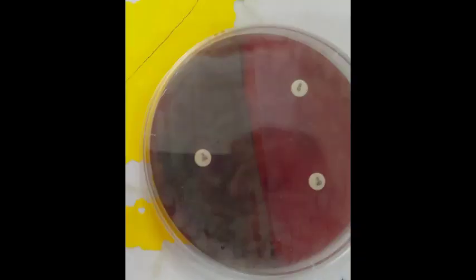After incubation, it was noted that the novobiocin disc developed an inhibition zone of 20 millimeters. Therefore, we can conclude that the Staphylococcus organism that we are identifying is Staphylococcus aureus. This is because it was positive for the coagulase tube method and it is susceptible to novobiocin.